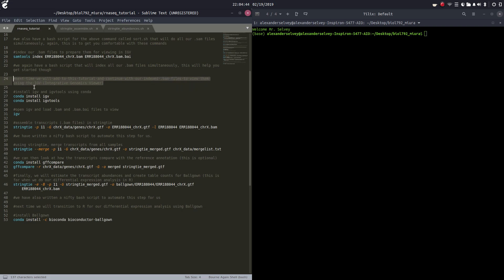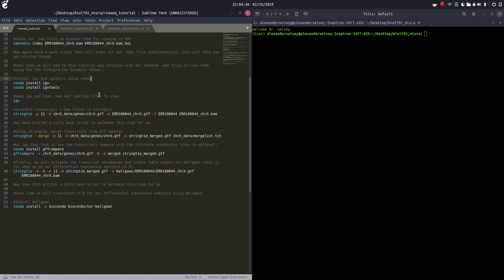Here are two pieces of code that we can run to install IGV and IGVtools. IGVtools is helpful when you're creating primers or other things like that in IGV, so we can just quickly run this piece of code.